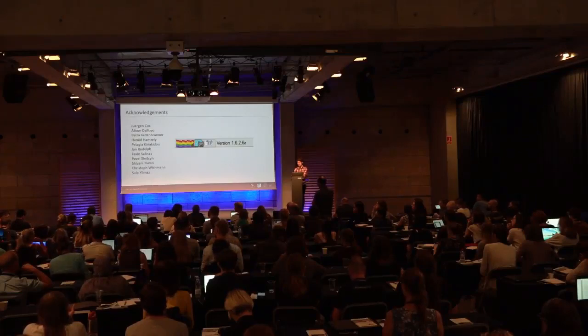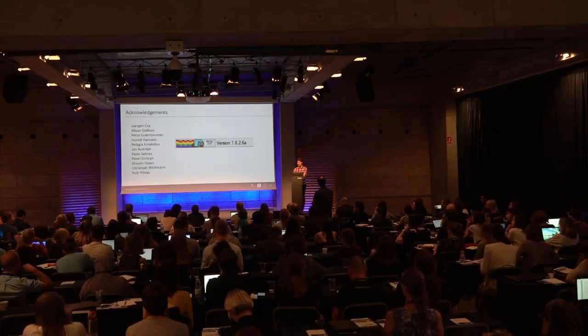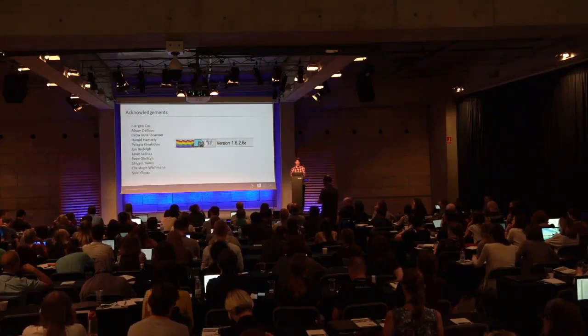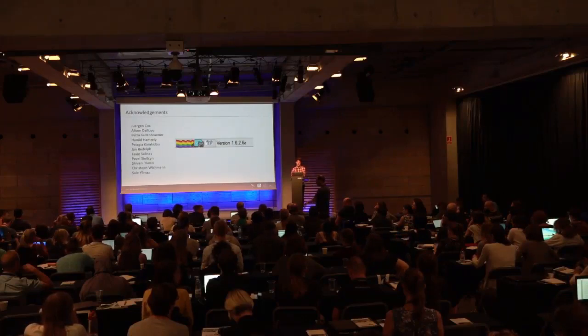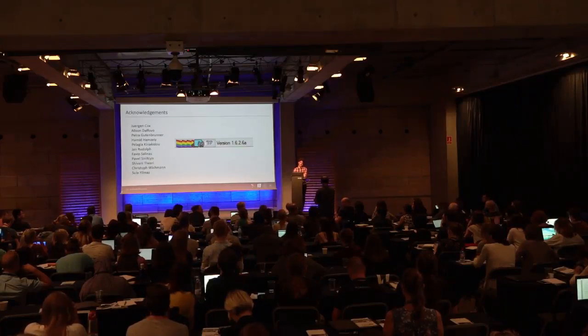My question is regarding UVPD, I mean ultraviolet photodissociation. Is MaxQuant able to process this kind of data, which is full of a wide range of ions, and is nowadays increasingly used to study these PTMs as well? Yeah, in principle, it's possible, but I think the scoring for UVPD still needs to be improved in MaxQuant.